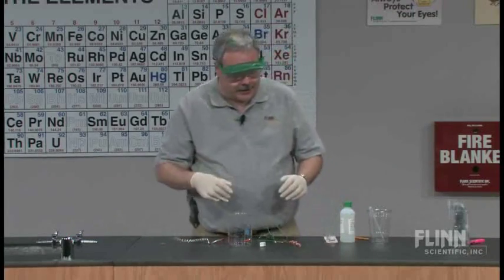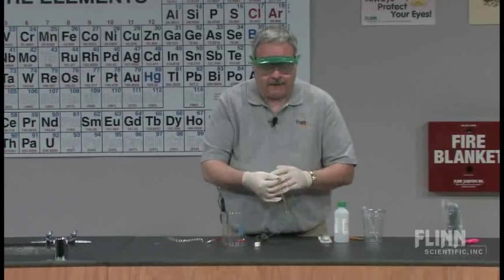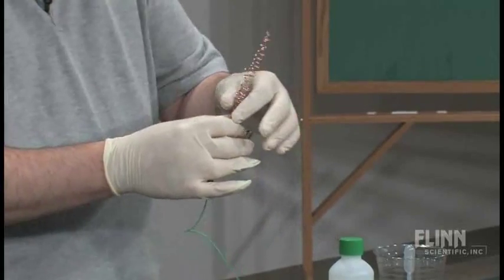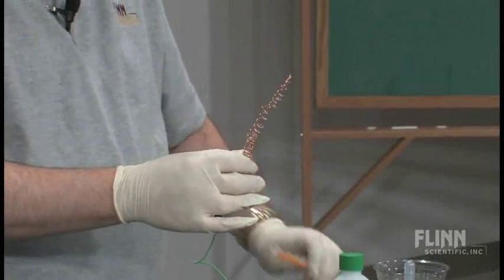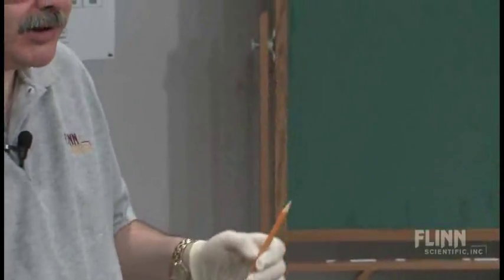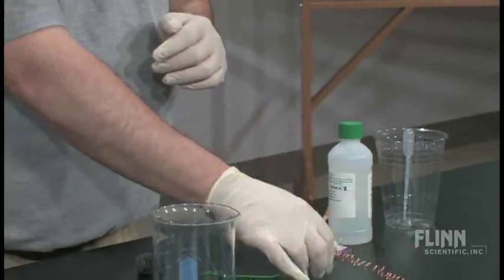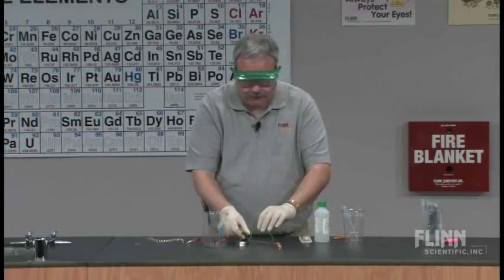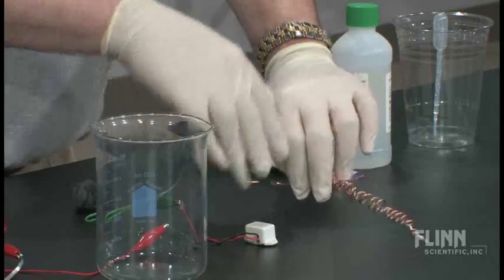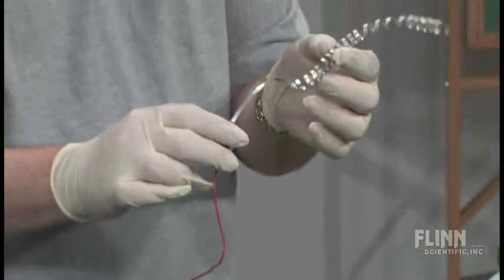What we have here is an interesting situation where we have two metals. We have a strand of copper wire that I have cleaned off with some steel wool to make sure it's clean, and I have wrapped it around a pencil so I have a strand of copper that's rolled up, and that's being hooked to an alligator clip. Then over here I have some magnesium ribbon.